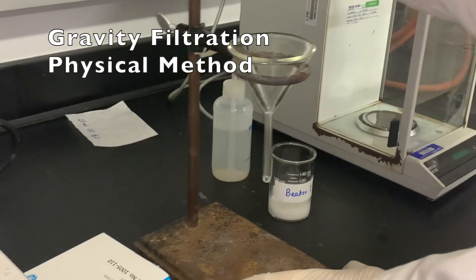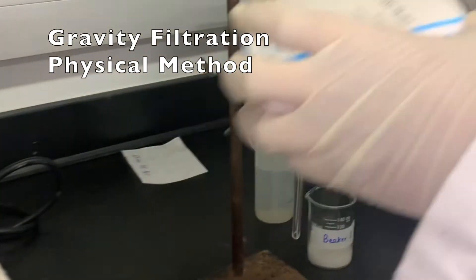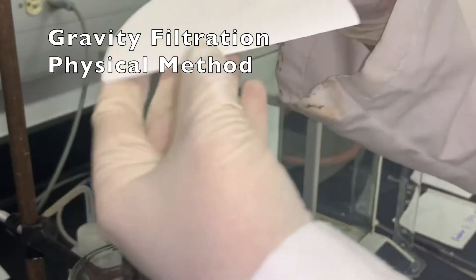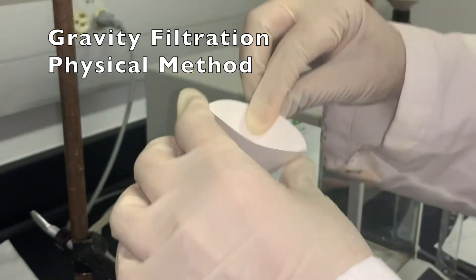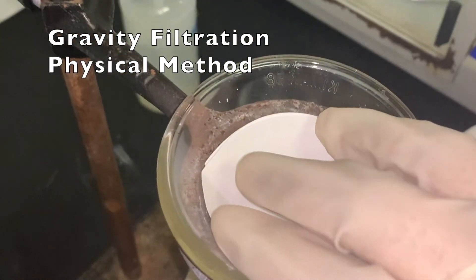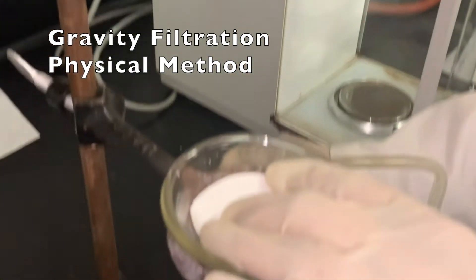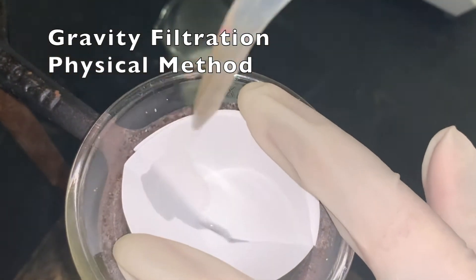For the gravity filtration, we need the stand, the iron ring, and the funnel. These are the filter papers. You have to fold the filter paper one time, then fold one more time, then open it just like a cone and put it in the funnel. Put beaker number 2 underneath. Since we dissolved the solid in water, I have to moisten the filter paper with a few drops of water only, to get it contacted with the walls.